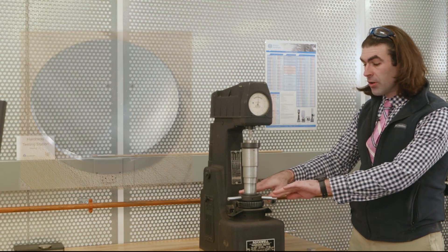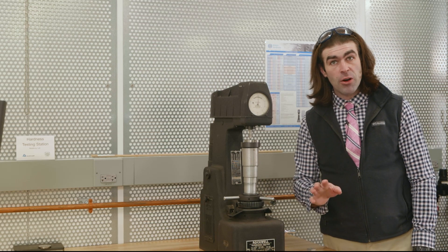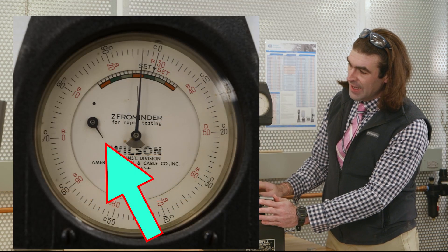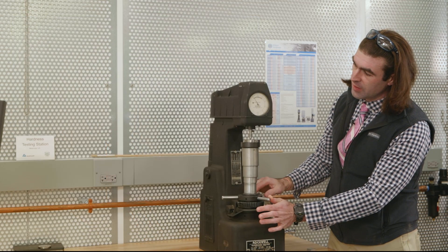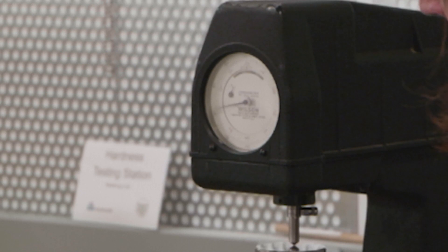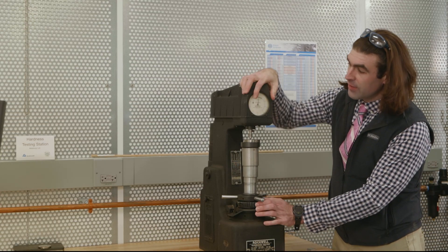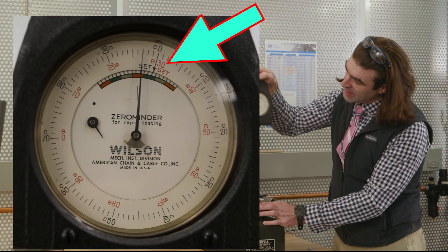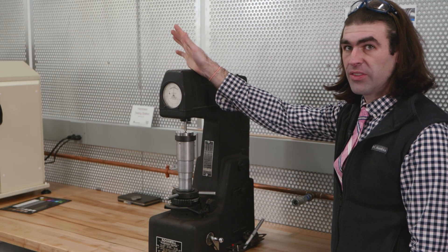Turn the wheel to the left until the indenter touches the material. Now check the dial — the small hand needs to line up with the dot at the 12 o'clock position. Spin the wheel to the left and you'll see both needles moving until the small hand is on the black dot. The larger hand you can adjust the dial to it, lining up where it says 'set' on the dial with the larger arrow.